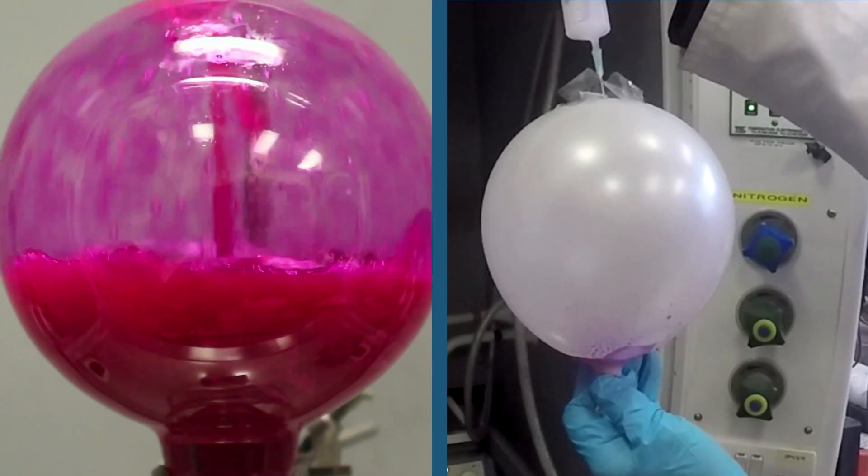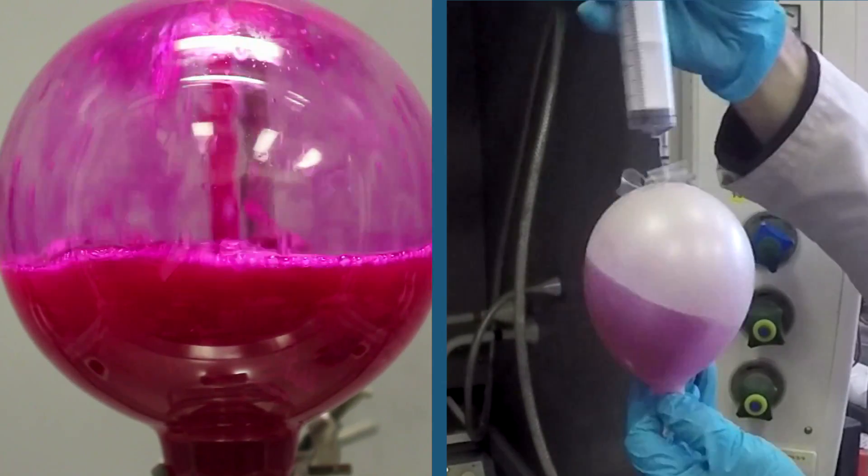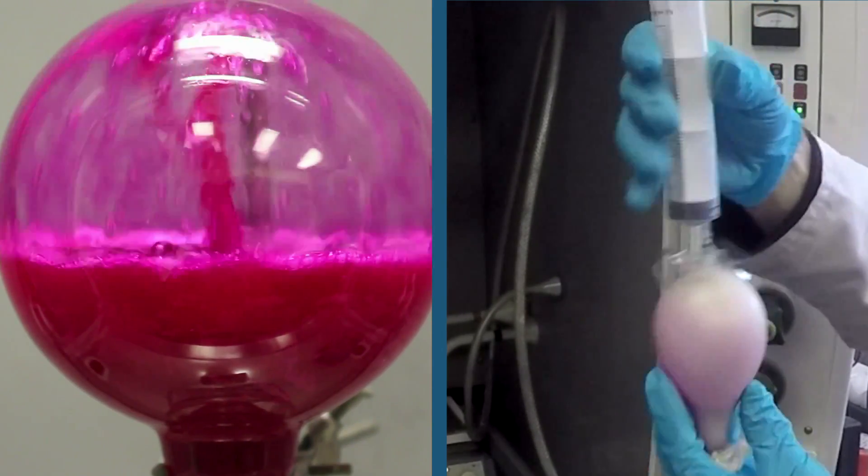Because in that, the size of the flask doesn't change. But really, both of them are fun and I hope you enjoy them.